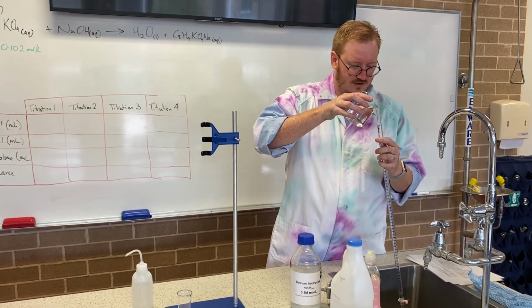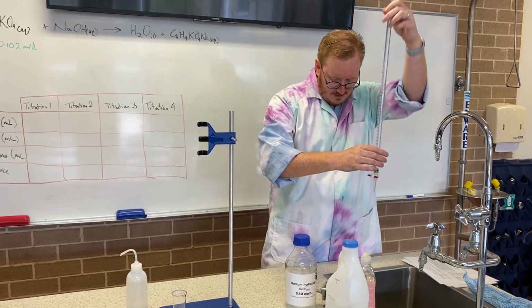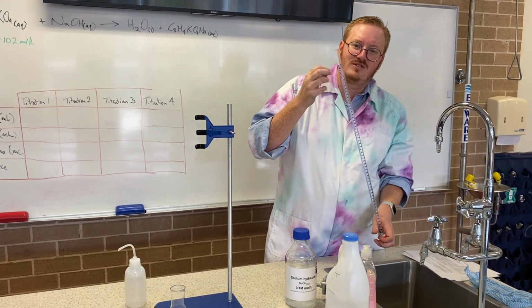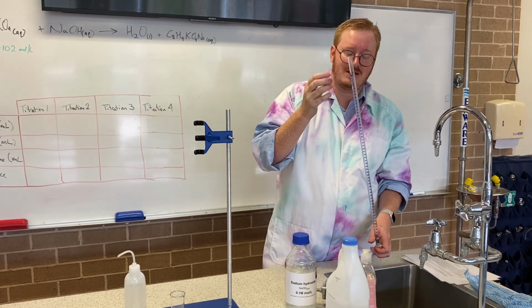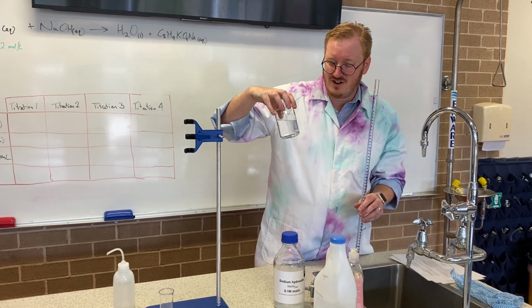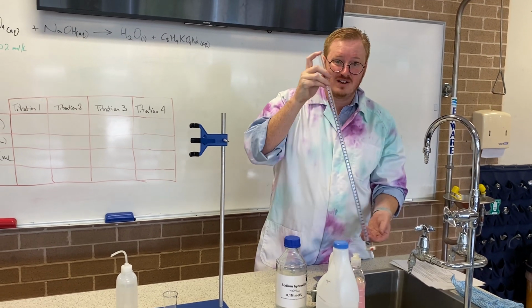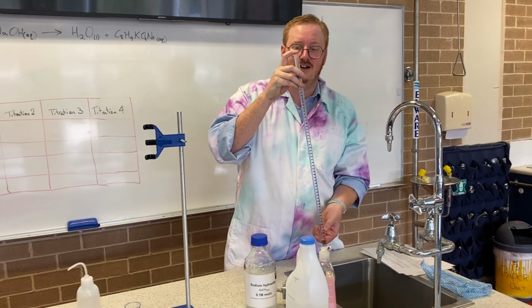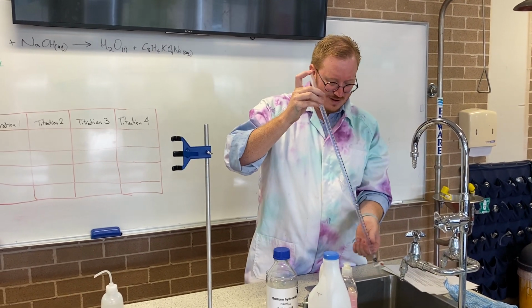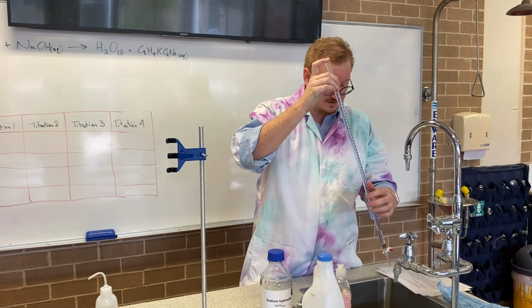Close the tap, pour a little bit in, just down the bottom. Okay, and I want to swirl it around. Something that I'm thinking of though, safety. Sodium hydroxide reacts with oils on the skin, it saponifies them, makes them all soapy. I don't want too strong sodium hydroxide on my skin, but I know I've got about 0.1 moles per litre. I'm not too worried in this instance by putting my finger on the top. But if you are, gloves is the word that I'm looking for. Wear gloves. But I'm not too worried. 0.1 mole per litre, it might feel a touch soapy to the skin, but other than that, it's all good, and I'll wash my hands after I'm done too.